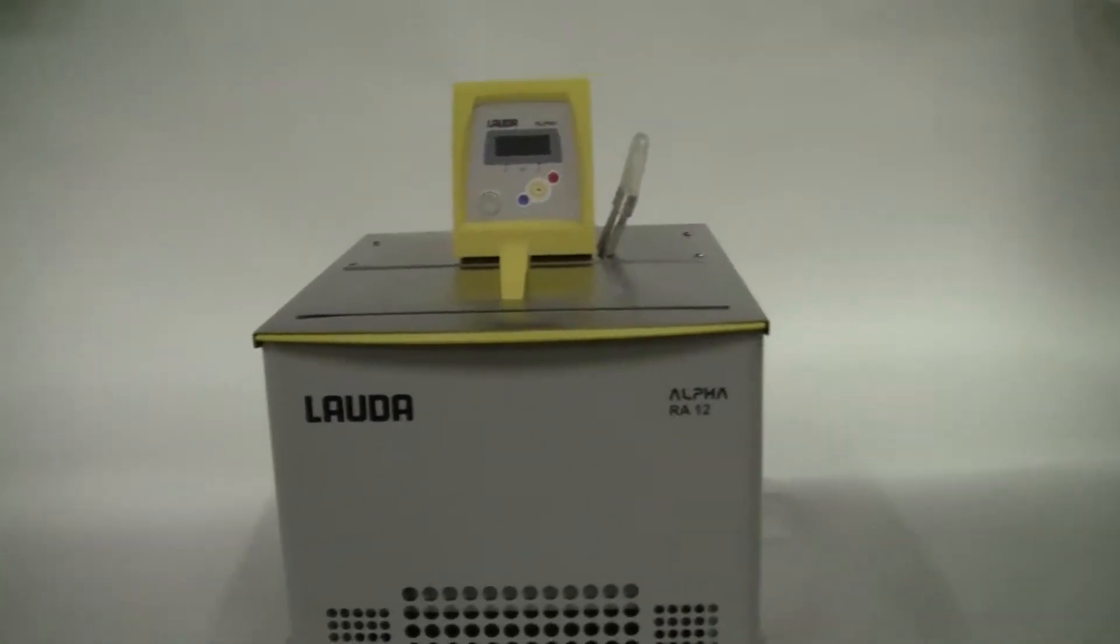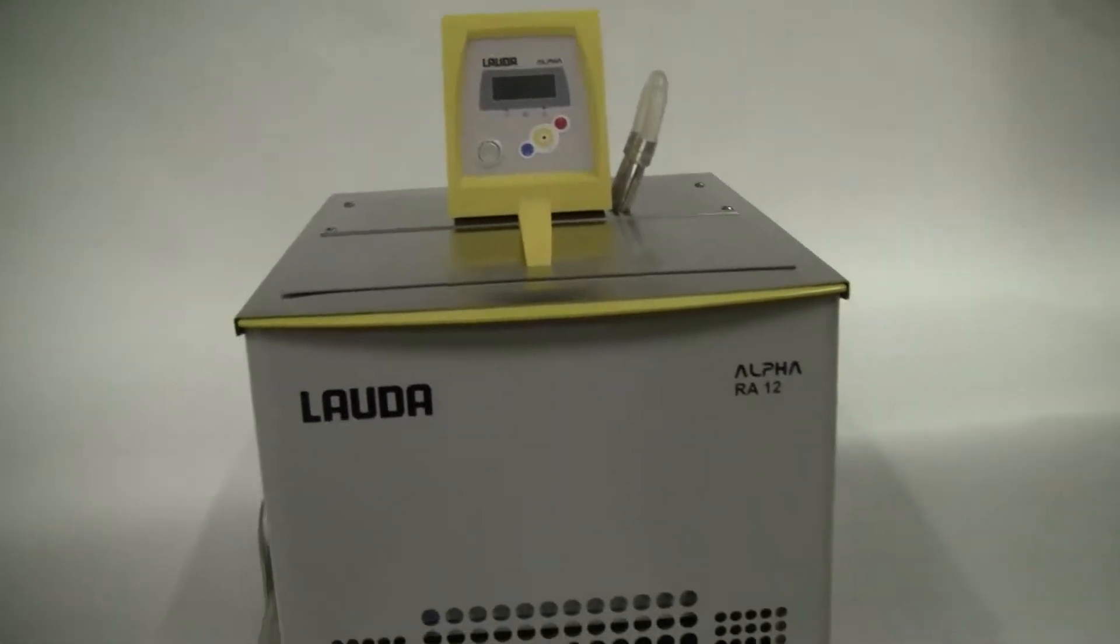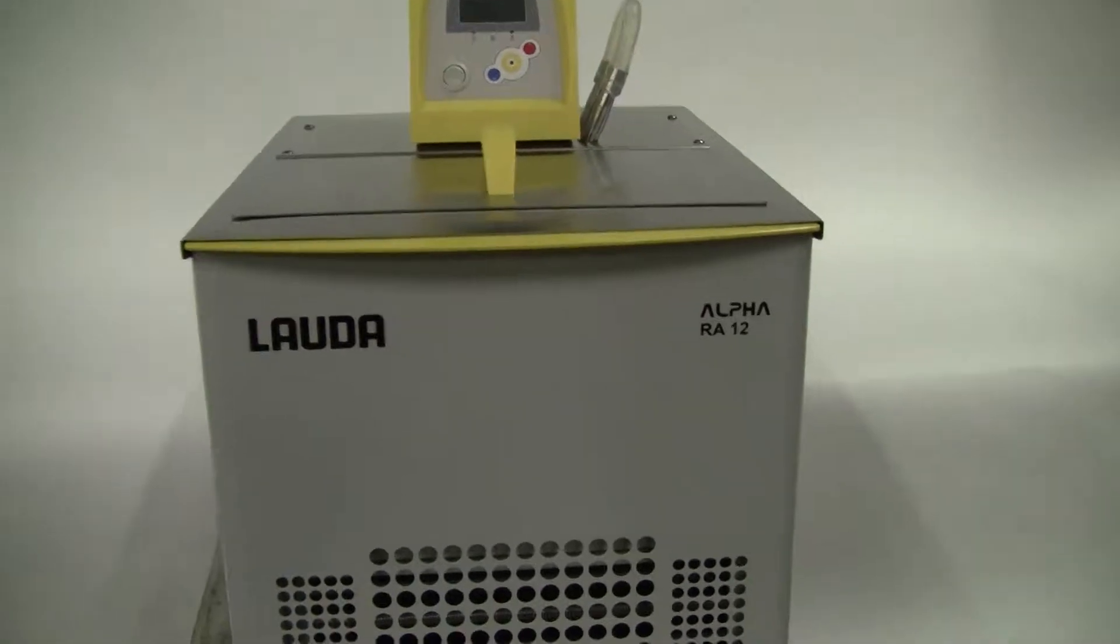Hi, this is Michael from HitechTrader. Today we're looking at a brand new Lauda Alpha RA12.